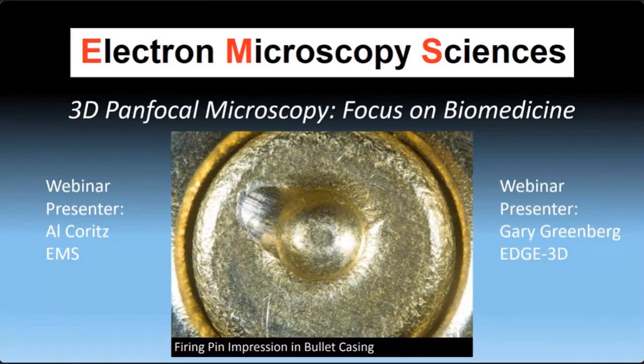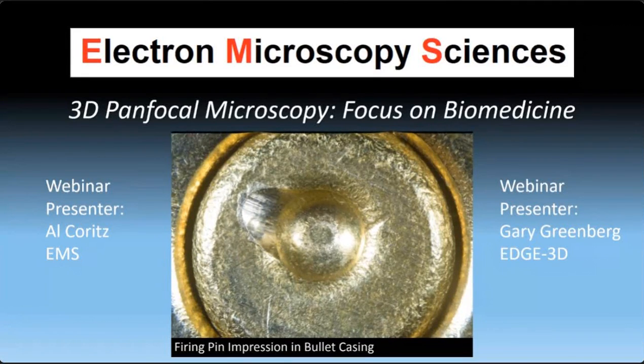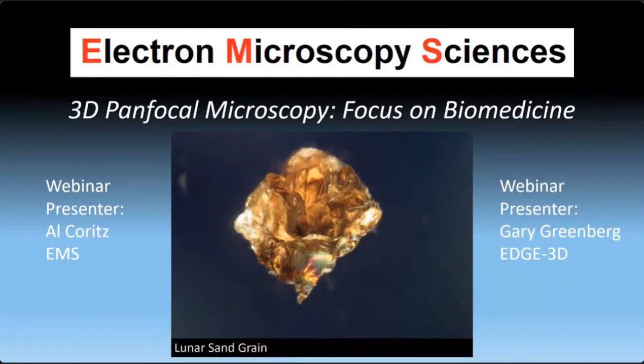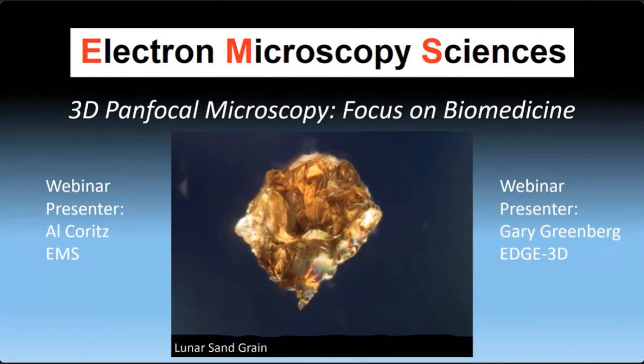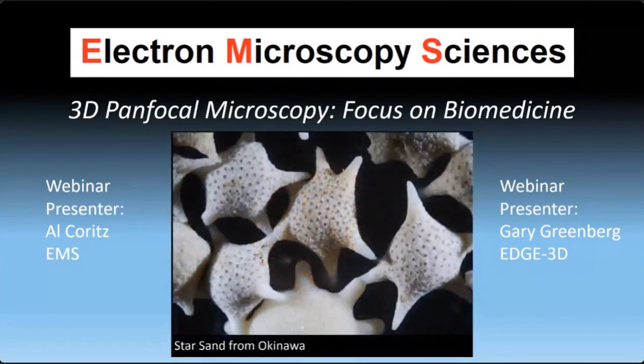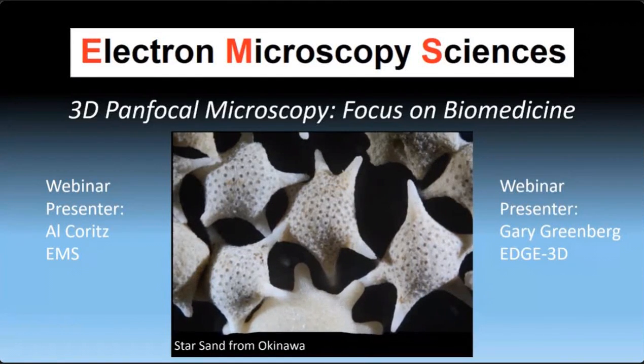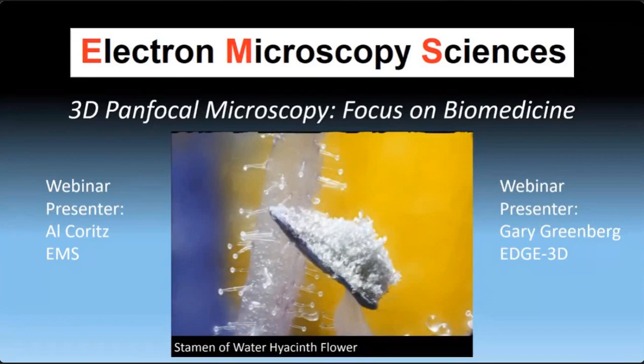Okay, well, let's get started. Today's topic is 3D panfocal microscopy, focus on biomedicine, presented by my colleague, Dr. Gary Greenberg. Gary, go ahead, it's your show.